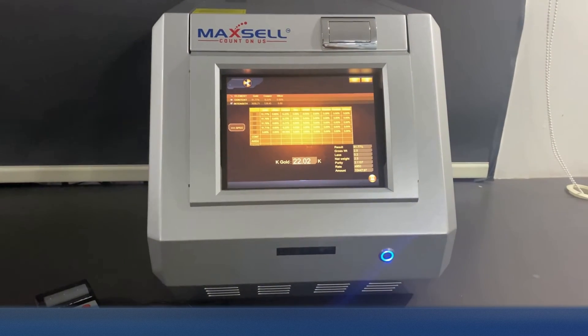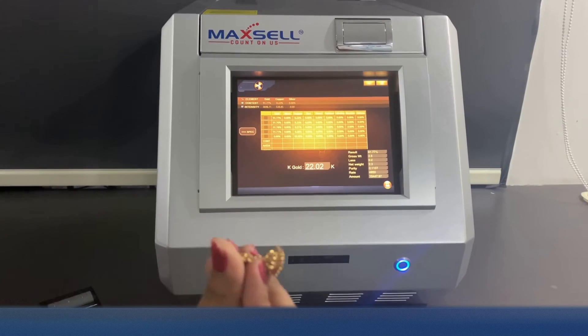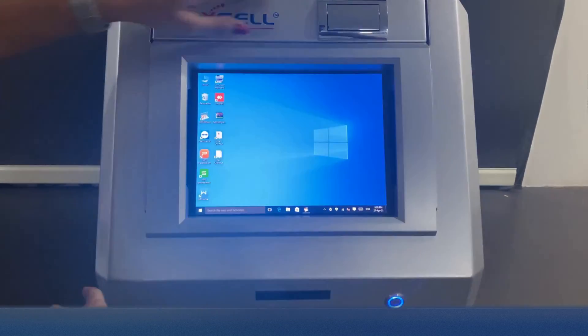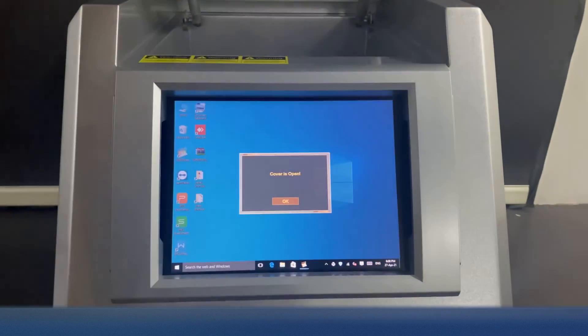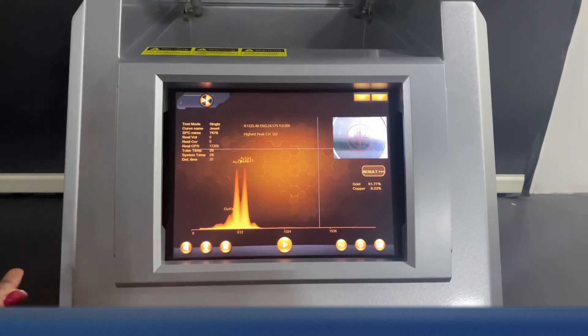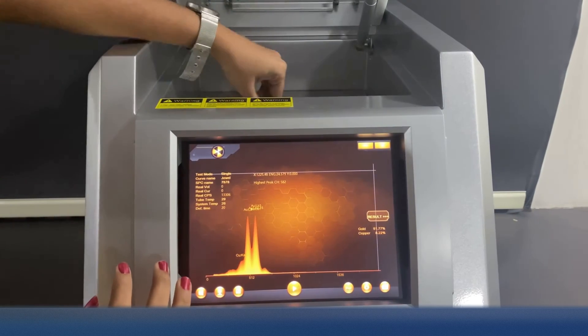We have already tested pure gold. Now let's test the fake gold. Maxell Carrot Pro has been manufactured keeping in mind the end users. This machine is modern and built with advanced technology.